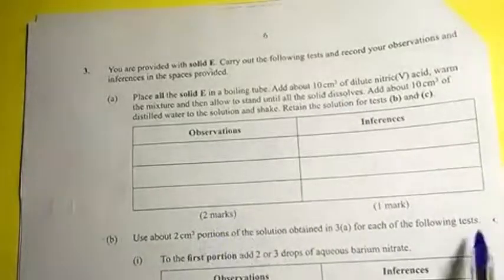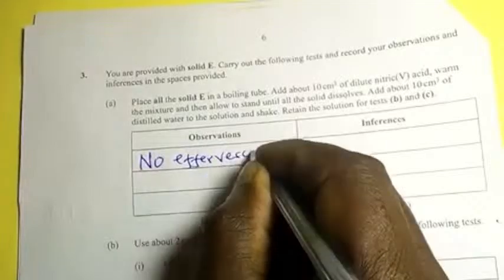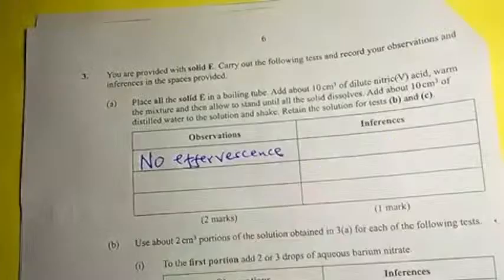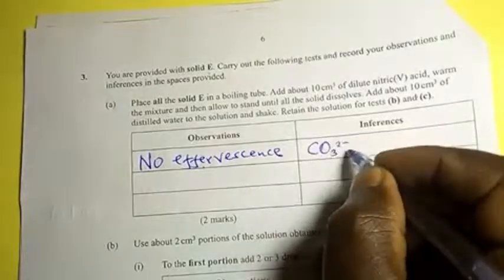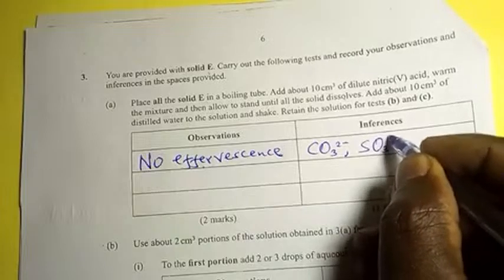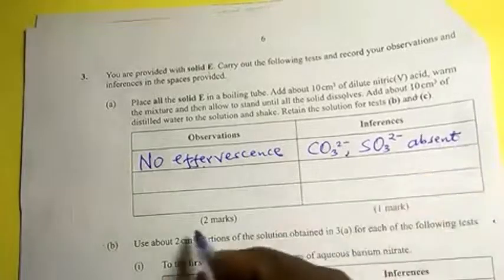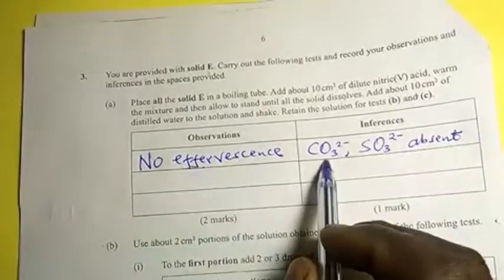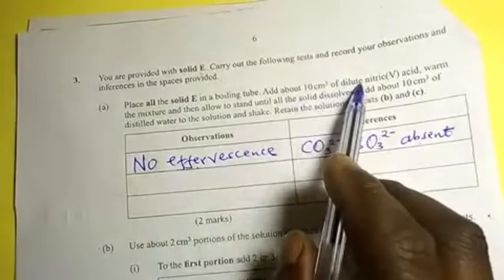So for this one, the observation was that there is no effervescence. So if there is no effervescence, it means that the carbonate, the sulfite is absent. If there was effervescence, then the carbonate and the sulfite is present. That is the observation number 1 for adding the acid.